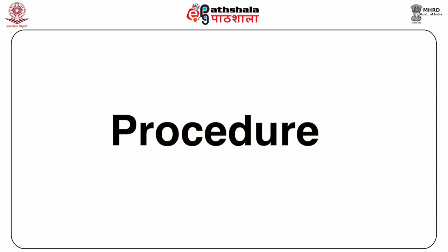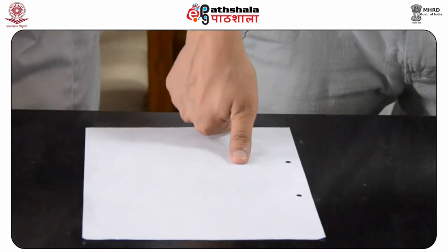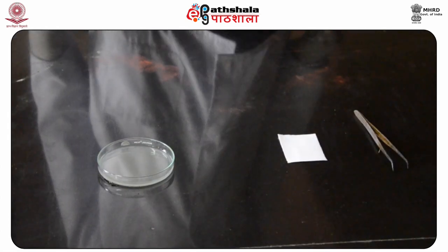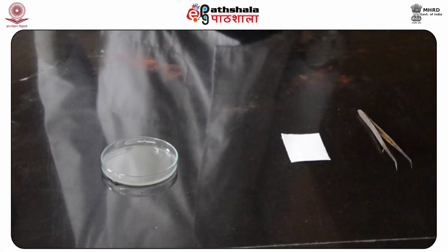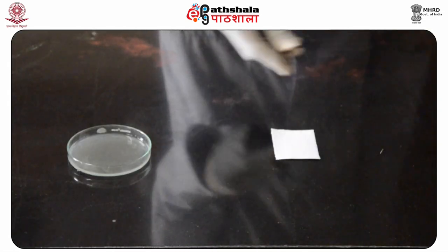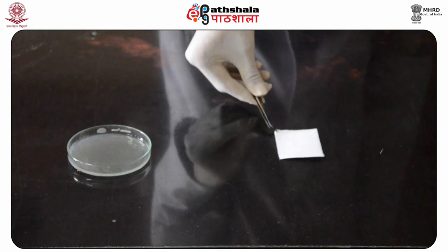Procedure. Let us take fingerprints on a piece of paper. Take silver nitrate solution in a petri dish. With the help of tong, place the piece of paper in the silver nitrate solution.